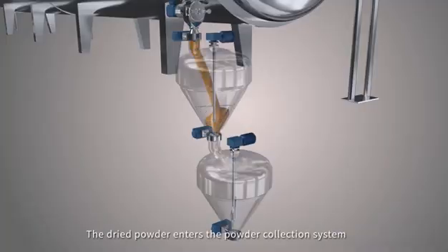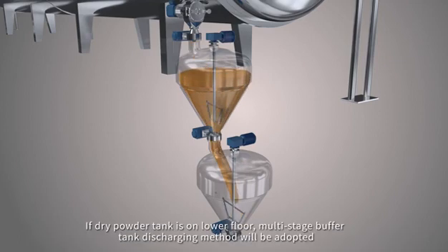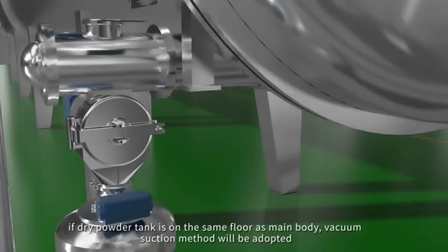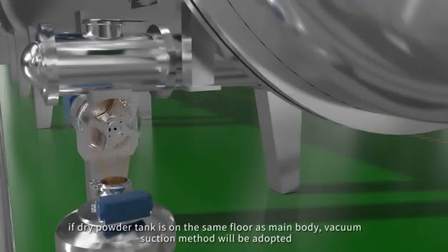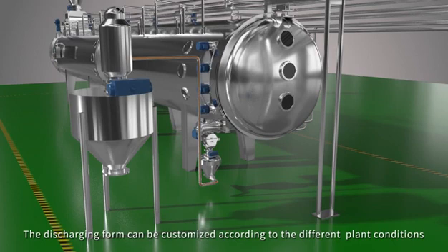The dried powder enters the powder collection system. The discharge tank has the functions of heat preservation, heat tracing, and mixing. If dry powder tank is on lower floor, multi-stage buffer tank discharging method will be adopted. If dry powder tank is on the same floor as main body, vacuum suction method will be adopted. The discharging form can be customized according to different plant conditions.